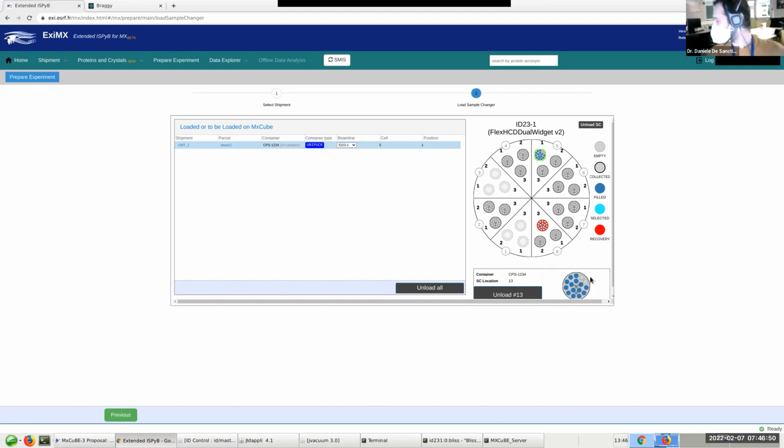So I think first I will check if Gianluca, we have any questions in the chat. Yeah, Pedro, question? Yes. So once you have the graphics display of the robot, you just click on the pucks and let me do it again. It will automatically assign them to the right position. No. So let me do it again.